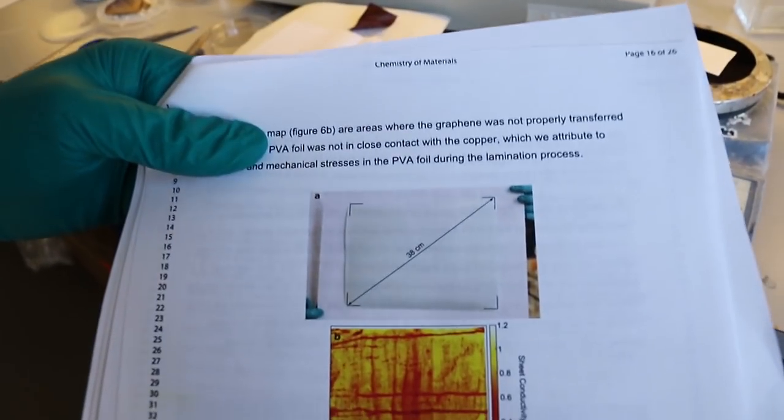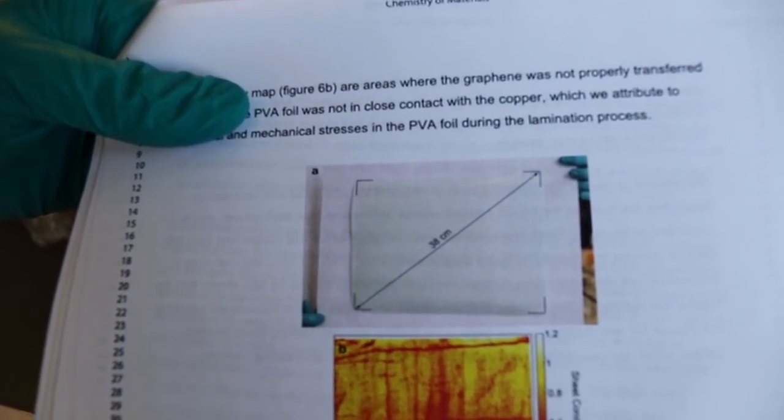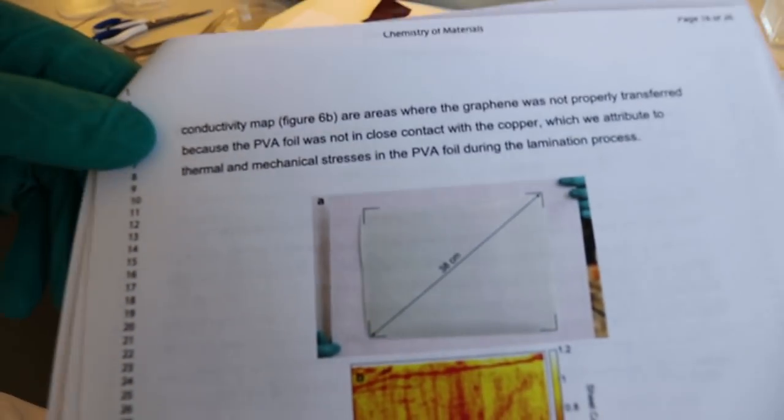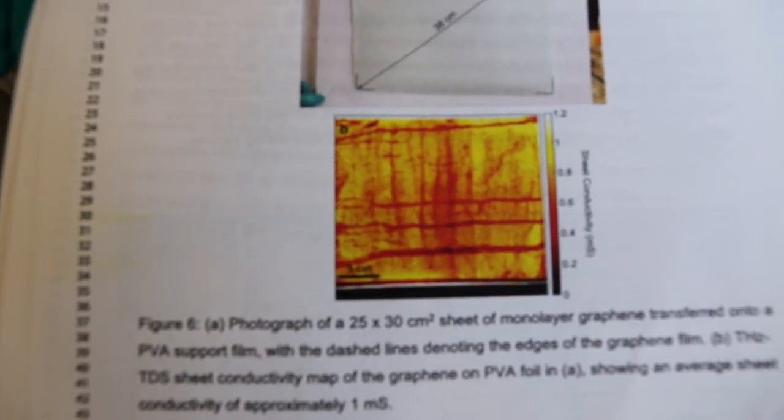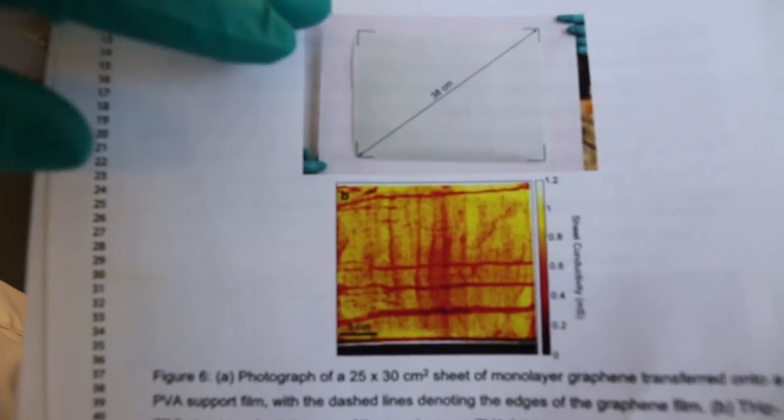See here, it's transferred A4 sheets of graphene using this method. So the top one is a photograph of A4 PVA foil with graphene on top, just as the one that we had, which has been ripped off the copper foil. What is that we see below? This is the terahertz conductance map of the graphene on the PVA foil from the image above.